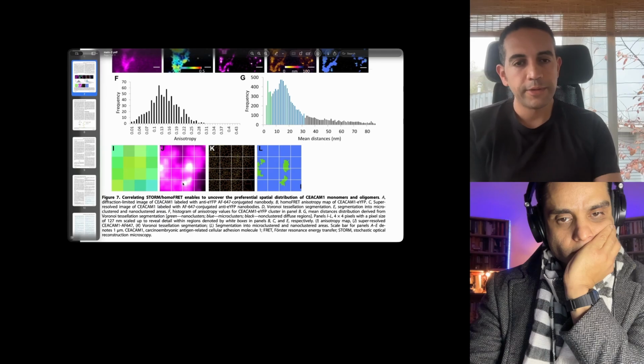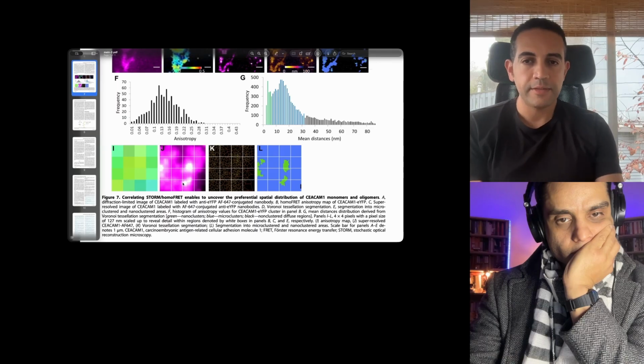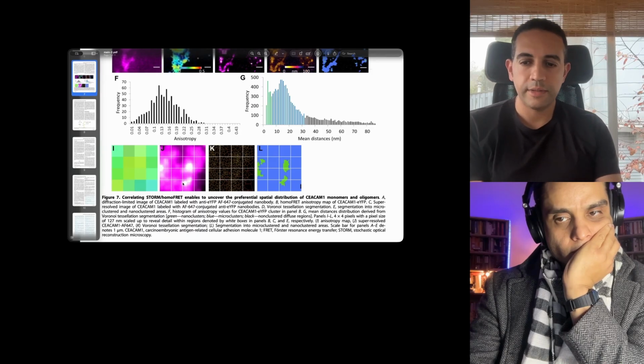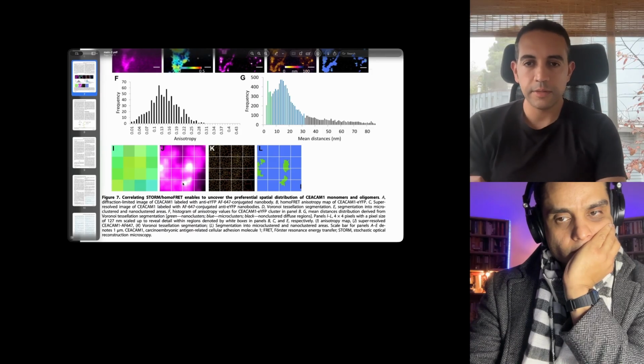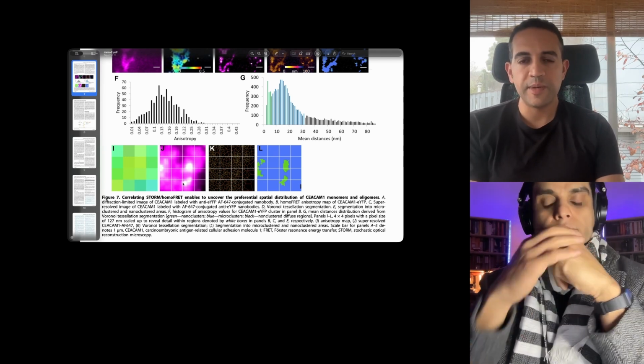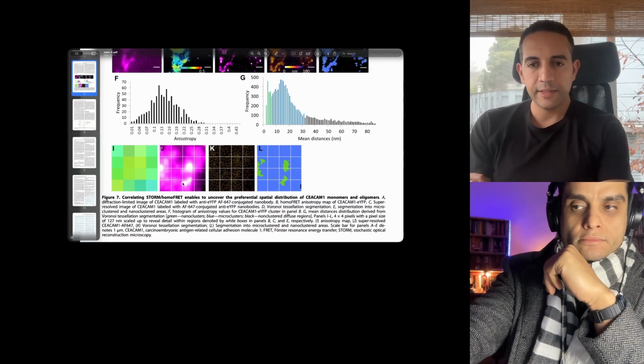And we reported on its results, and we're pretty confident that what we're measuring here is these CEACAM proteins do indeed form monomeric clusters and have diffuse dimers, oligomers that dissociate to go into these monomeric clusters. And we had, it's not in this paper, it's in my thesis, point mutants to further validate this.